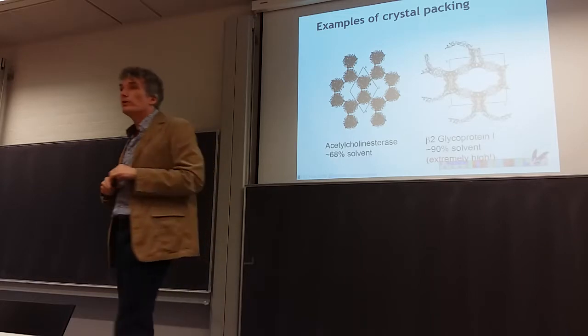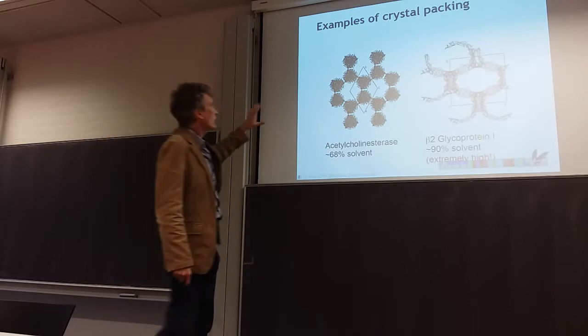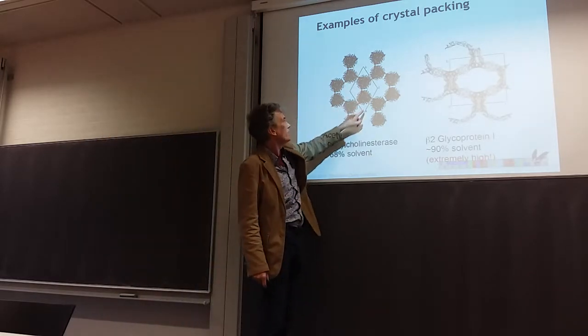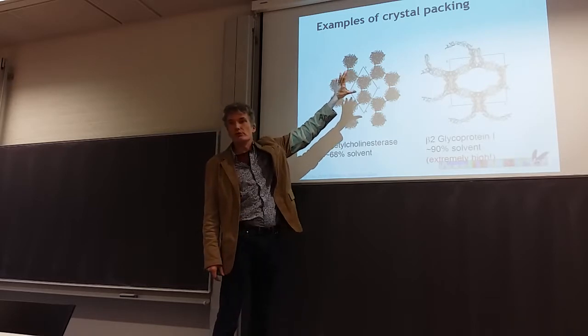Is a crystal just like one layer of protein? No, this is three-dimensional. Yeah, it goes in. But it's hard to draw on the board. So the actual, yes, but it's a good point. So the actual repetitive unit is not like this flat shape. It's actually a box. Right?